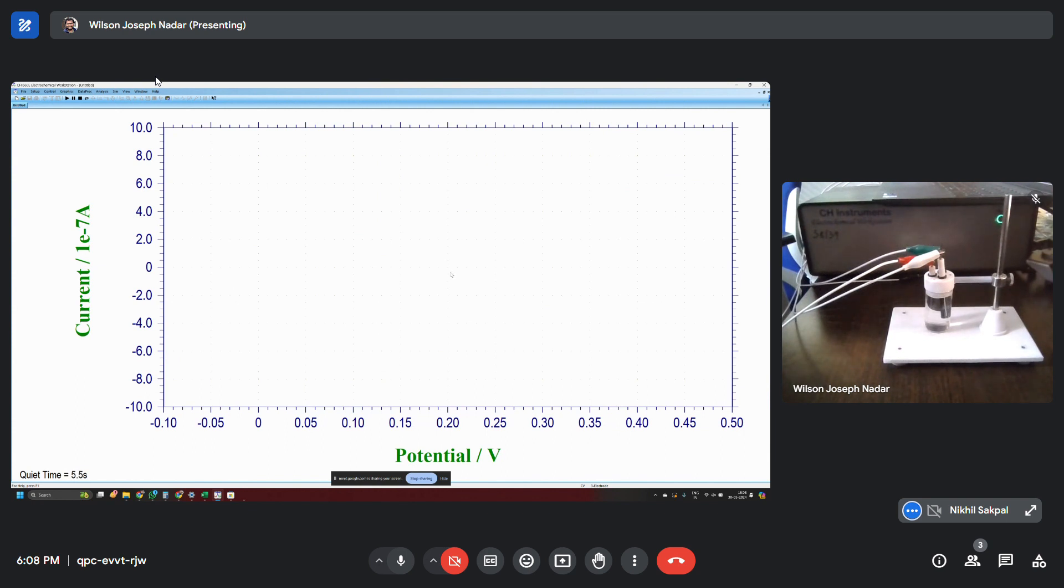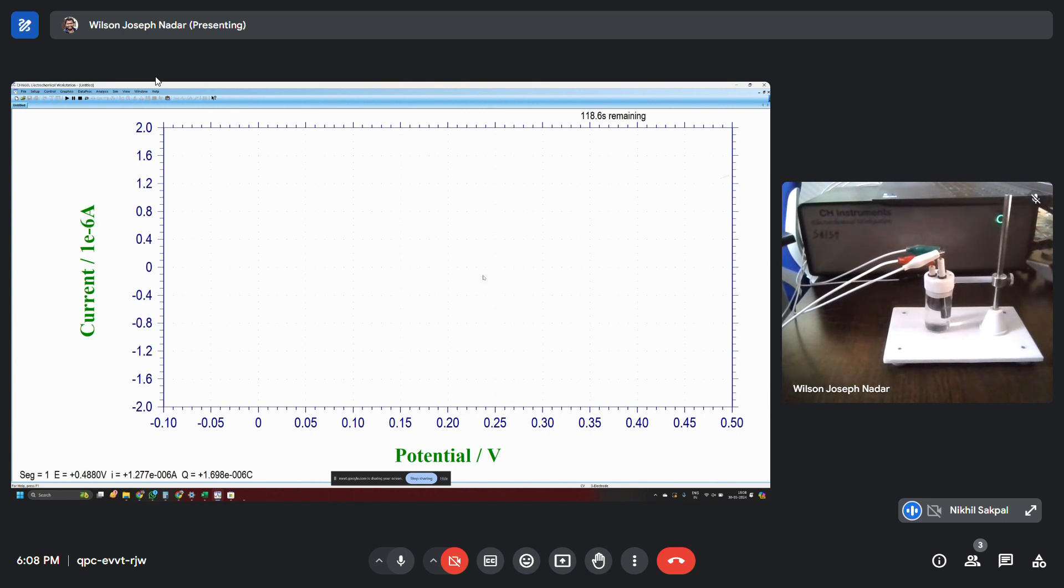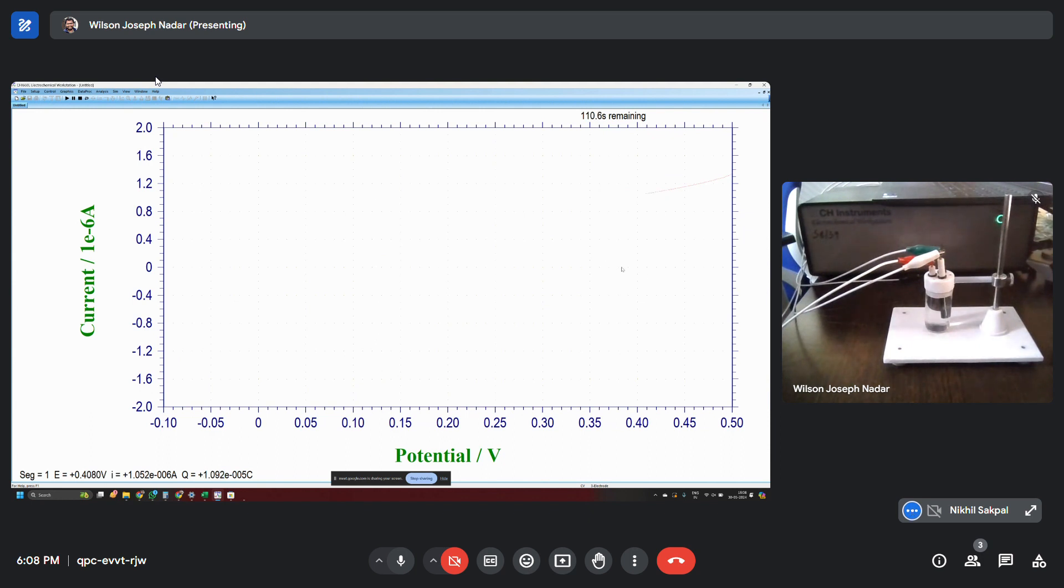Now this things we have not seen. The quiet time was changed to 10 seconds and probably it's an LSV. LSV probably being run with 0.521, with a scan rate of very low scan rate, seems like 10 millivolt per second.